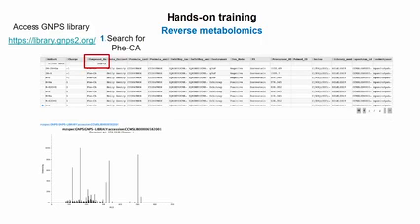It has been deposited by Emily Gentry, and it's gonna be the USI that is indicated also here on the slides. So you want to use the one that has the 2001 at the end, and then copy paste that USI. And then when you get there, then we're going to use it. But just please use the same USI to make sure everything is more fluid.